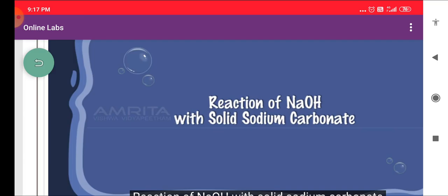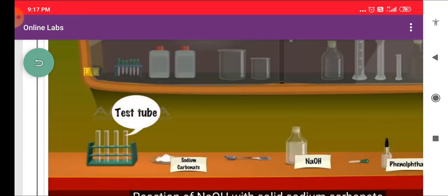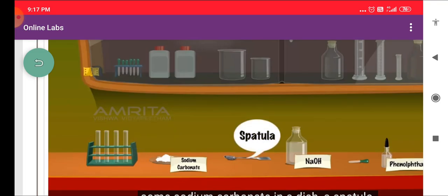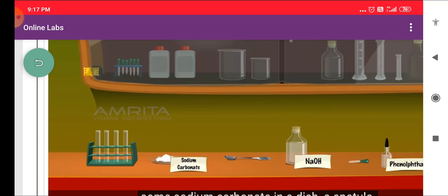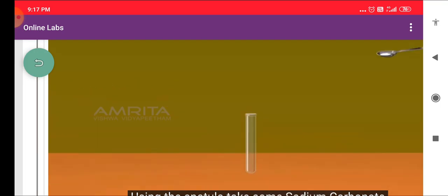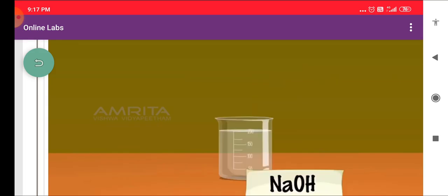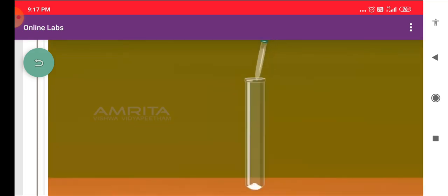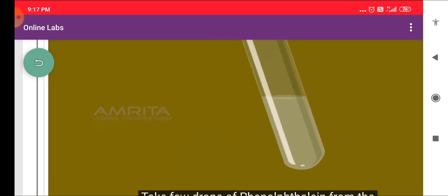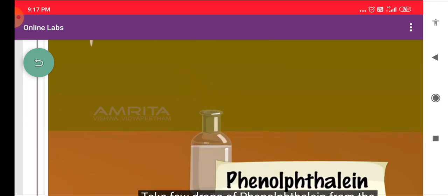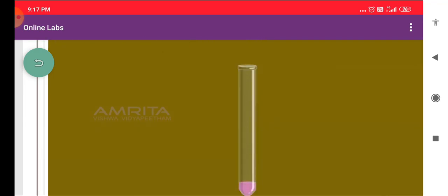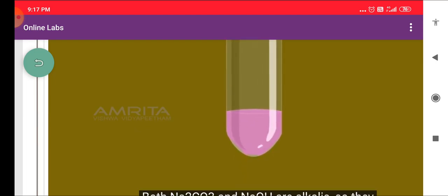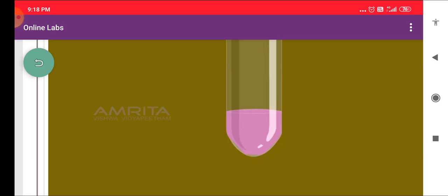Reaction of NaOH with solid sodium carbonate. We require a test tube, a test tube rack, some sodium carbonate in a dish, a spatula, NaOH solution, a dropper, and phenolphthalein solution. Using the spatula, take some sodium carbonate from the dish and transfer it into the test tube. Pour some NaOH solution into the test tube and shake it well. Take a few drops of phenolphthalein from the bottle using the dropper and pour them into the test tube. The color of the solution turns pink. Both Na₂CO₃ and NaOH are alkaline, so they do not react with each other but form alkaline solutions. Phenolphthalein produces a pink color in alkaline medium.